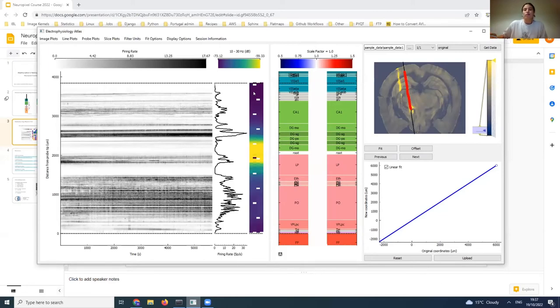Once you open the GUI and load in your data, you should see a display like this. It basically has two panels. On the left-hand side, we have all of the electrophysiology features. And in the center and right panel, we show the histology—where the electrodes are in the brain.